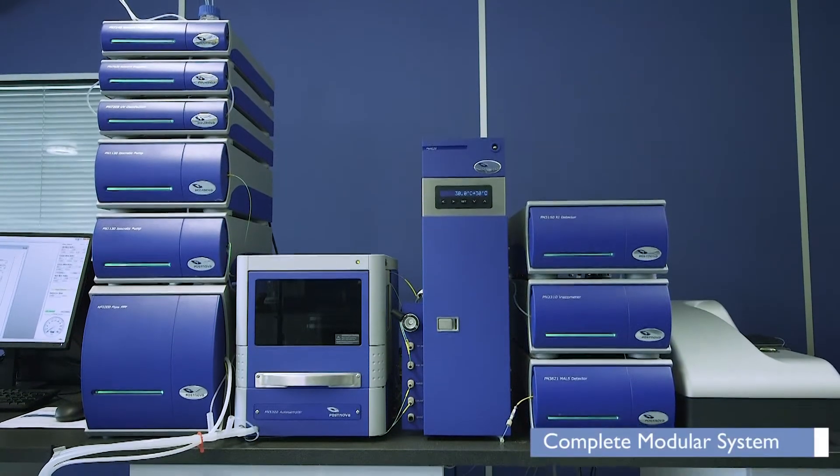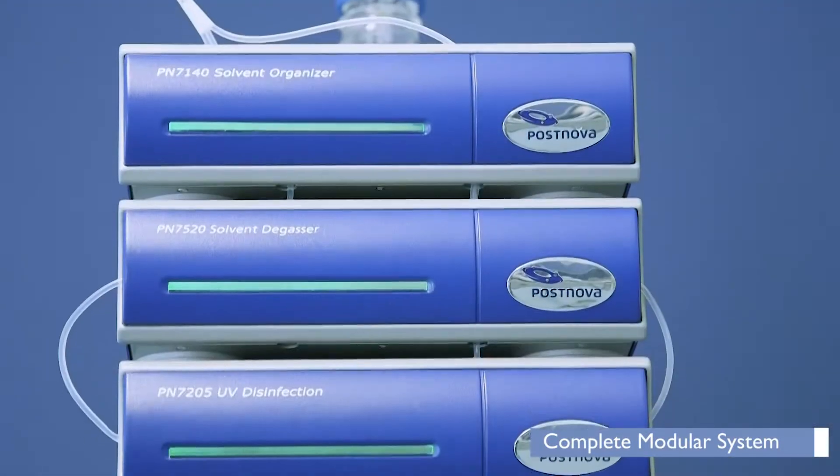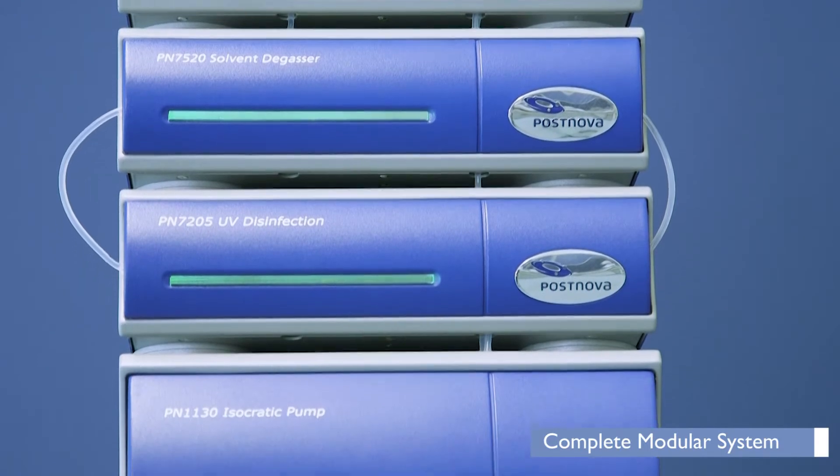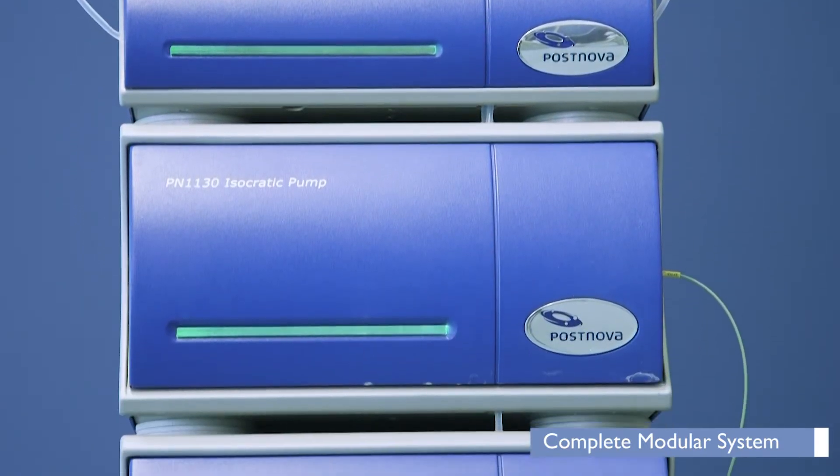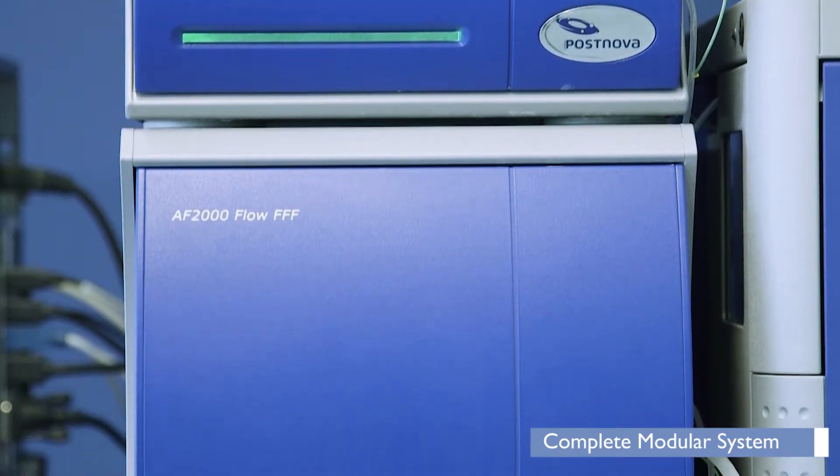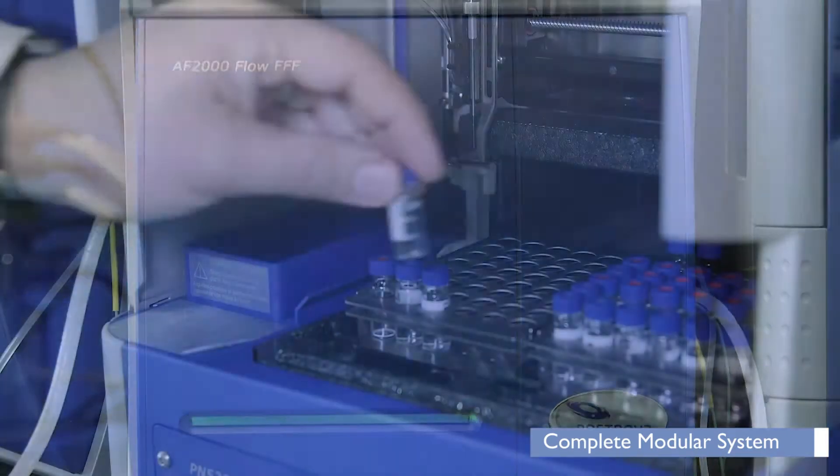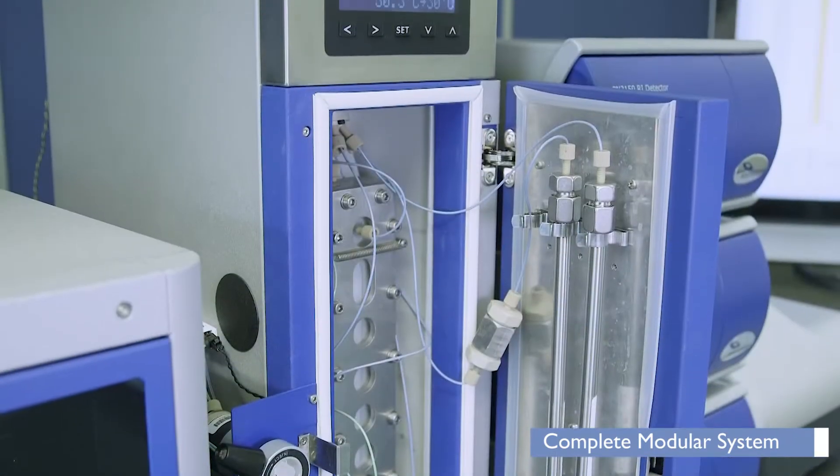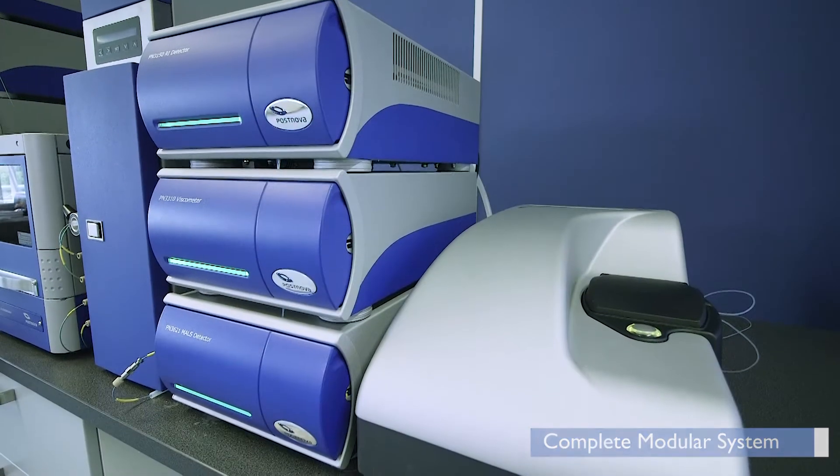The complete AF2000 system comprises a solvent organizer, solvent degasser, UV disinfection module and then the eluent pump, focus pump and the AF2000 cross-flow controller, auto sampler, channel thermostat and detectors.